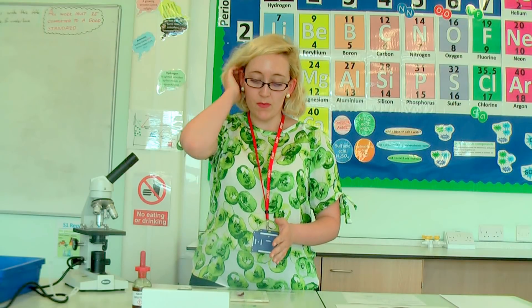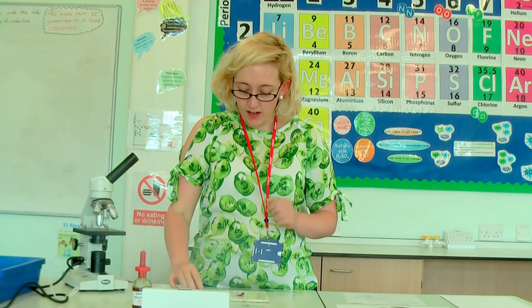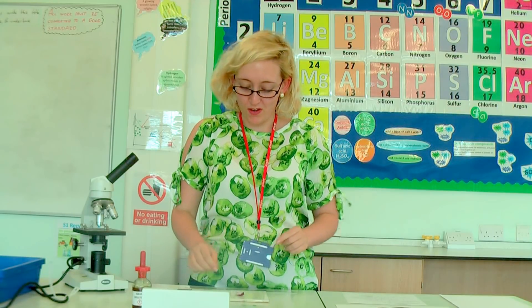First we will make our onion skin slide. I have got my glass slide already in front of me. I put a drop of water on it — that makes sure that the onion skin can stick on there when I put it on. I've also cut up a red onion today; it makes it a little bit easier to see the cells as they're slightly stained. You can use a white onion, it's not a problem — it is up to you.